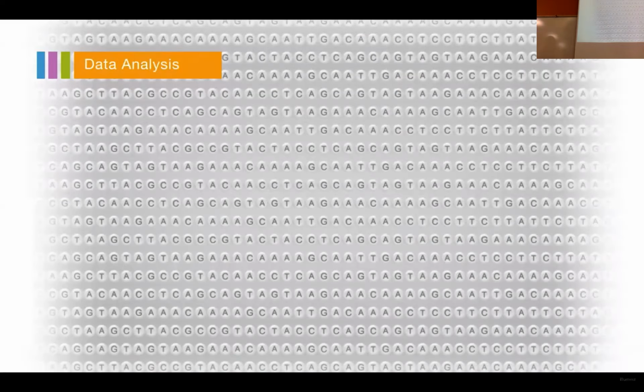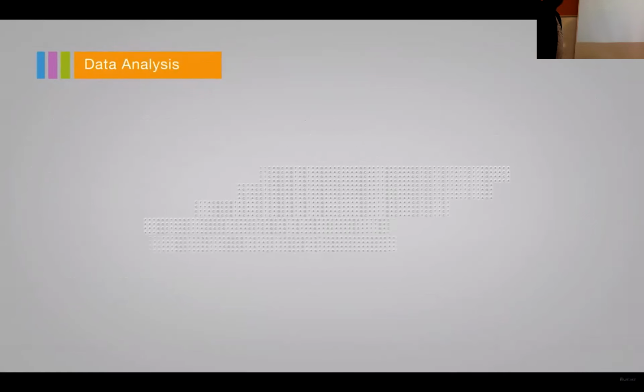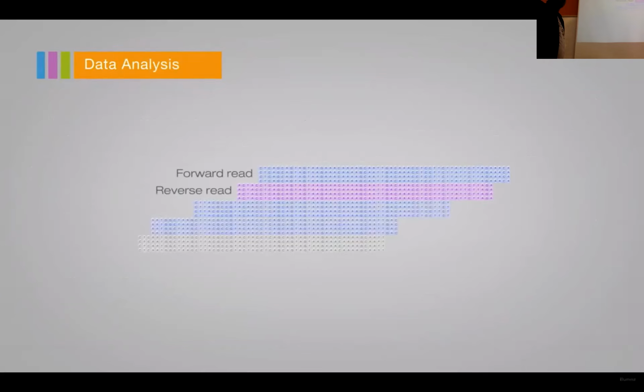This entire process generates millions of reads, representing all the fragments. Sequences from pooled sample libraries are separated based on the unique indices introduced during the sample preparation. For each sample, reads with similar stretches of base calls are locally clustered. Forward and reverse reads are paired, creating contiguous sequences. These contiguous sequences are aligned back to the reference genome for variant identification.